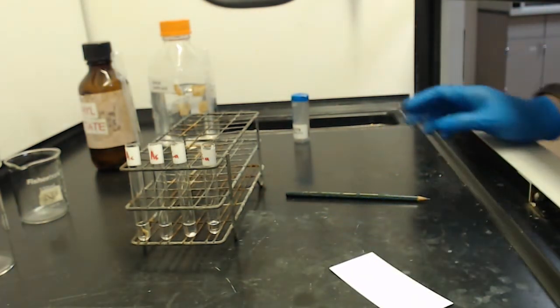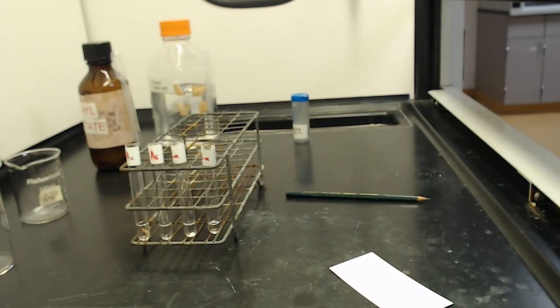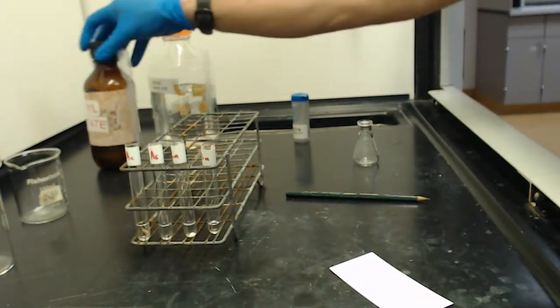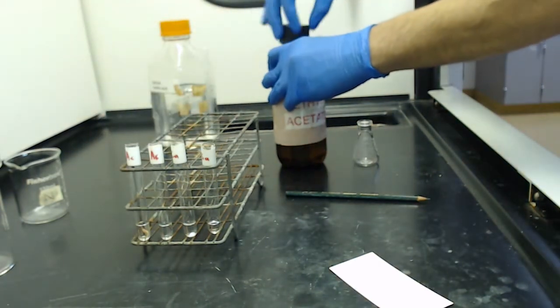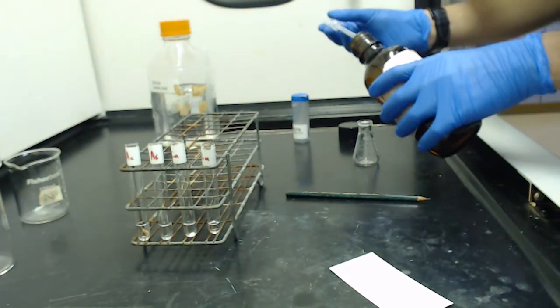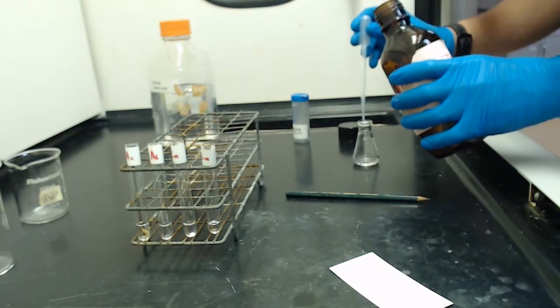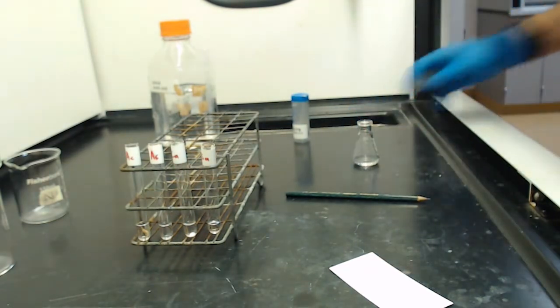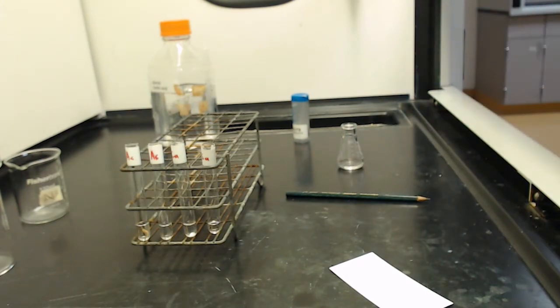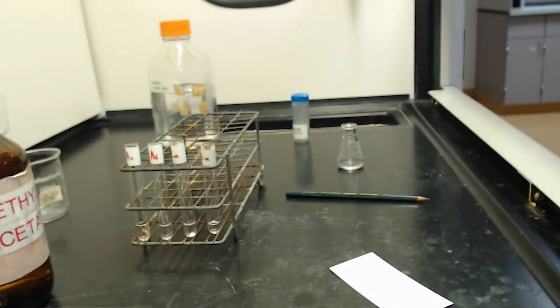Here we are going to need a little bit of ethyl acetate. I'm going to put this in here for cleaning in between samples. You don't need very much, just a couple milliliters. That should be plenty, as long as it doesn't evaporate. And then I recommend that you have a paper towel on standby on the side to help us with the capillary tube.